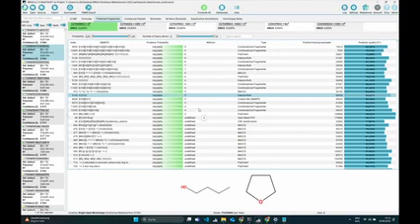So I was wondering, when we do our preprocessing, usually in MZmine, we have a positive ionization measurement and a negative ionization measurement, and we usually like to merge them and use the MGF that comes out of that in SIRIUS. So we have both negative and positive. I was wondering if this confuses ZODIAC in some way, because I never got a satisfying answer when I was looking for this.